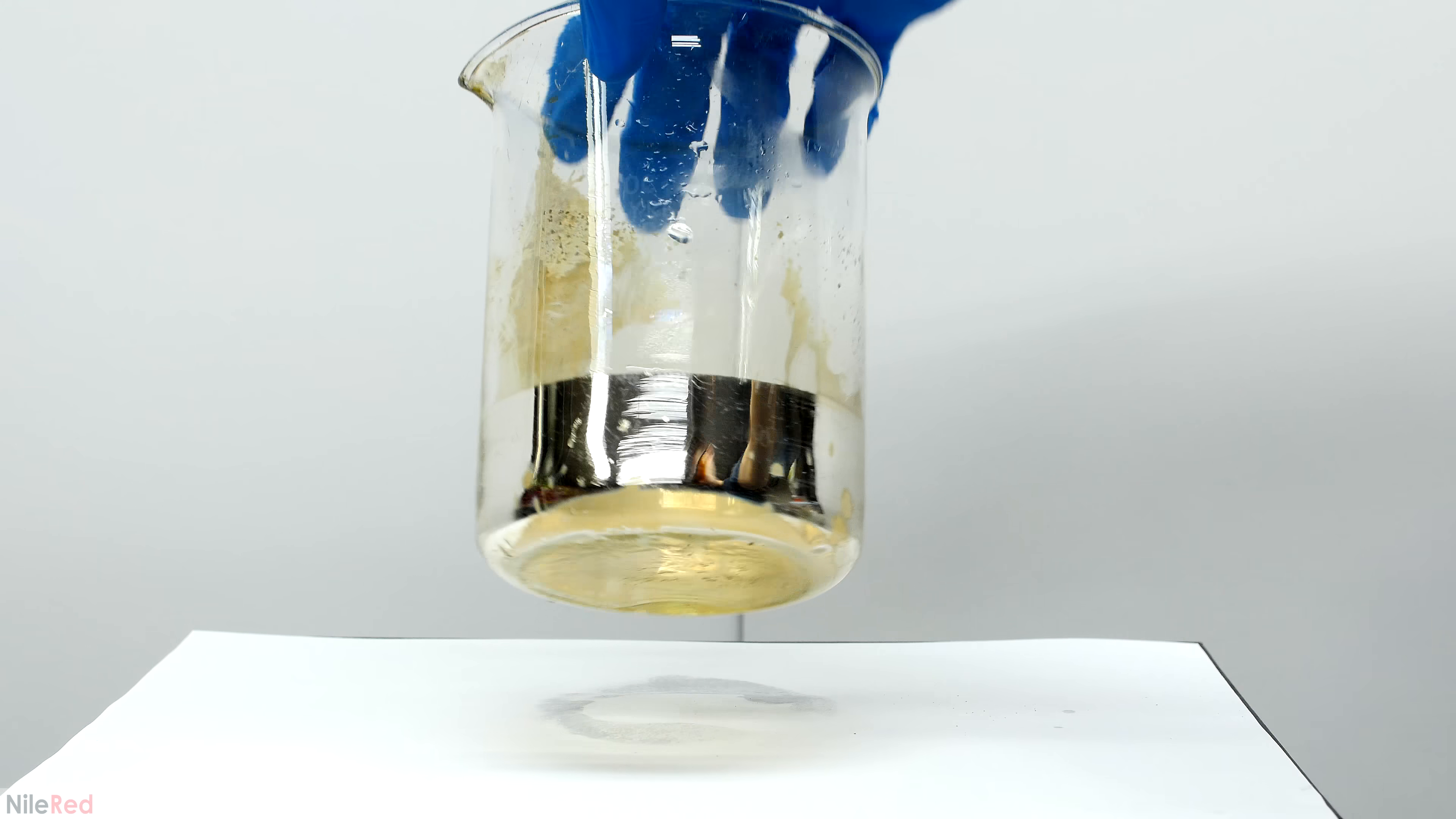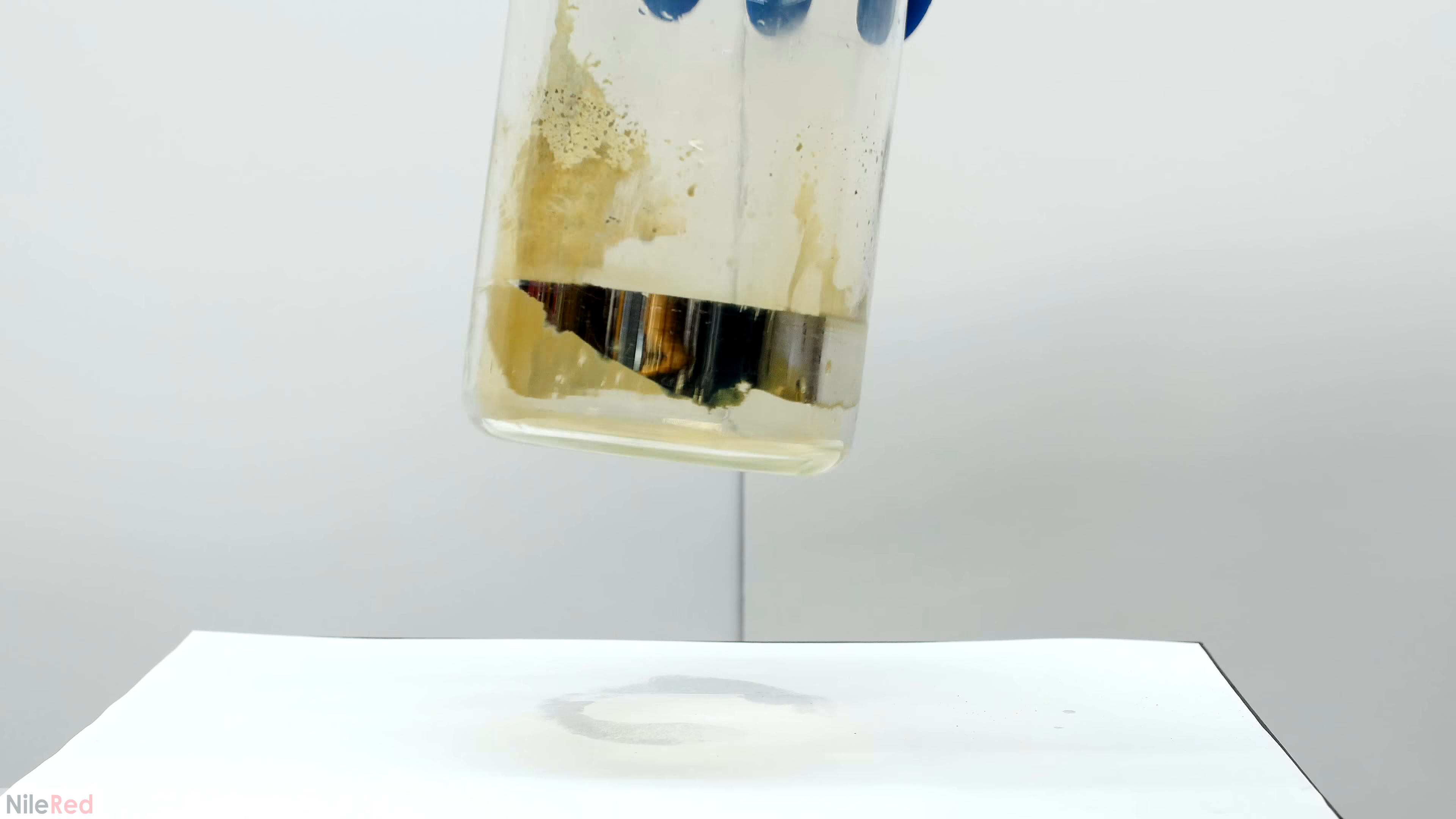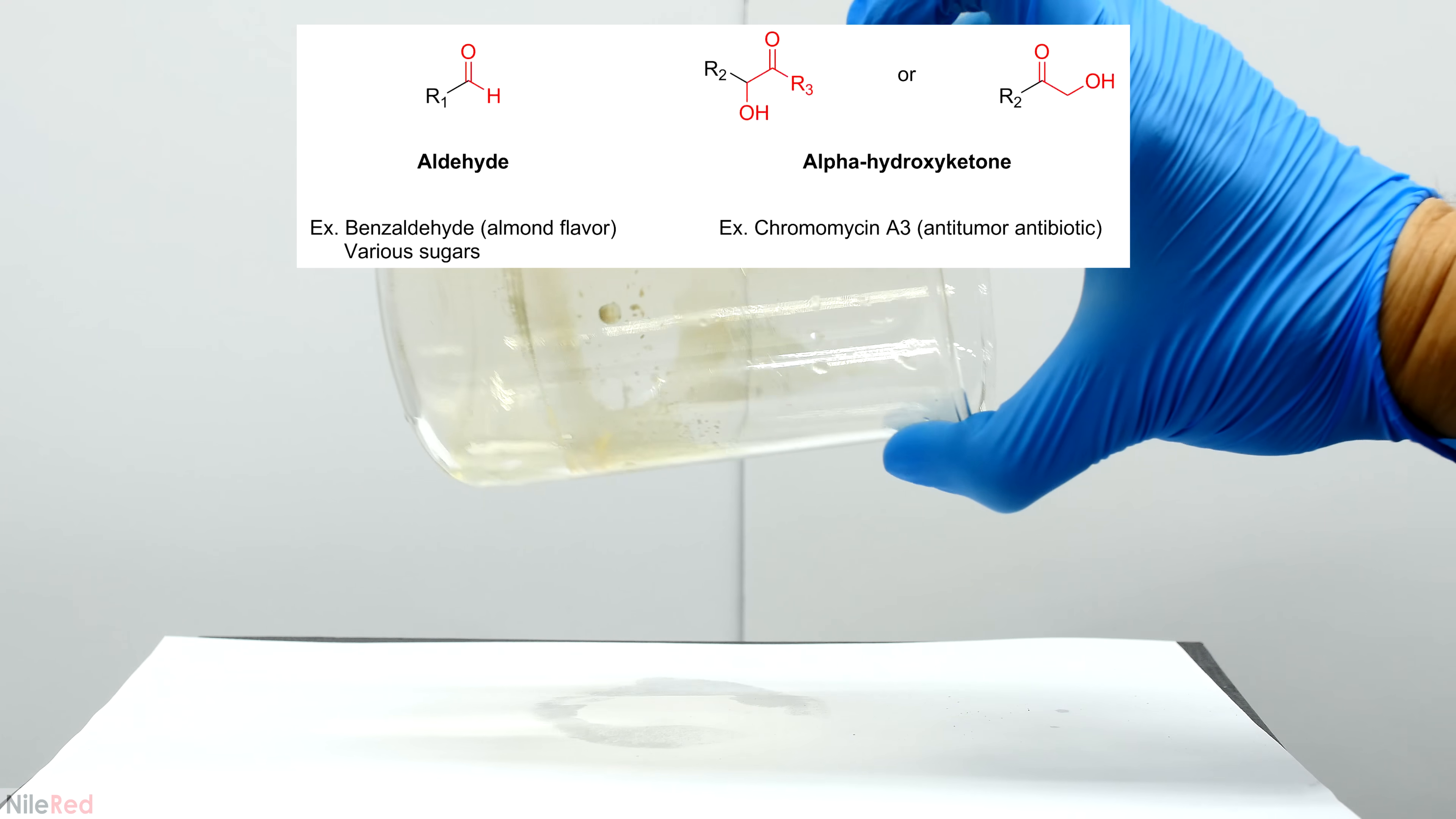That's about it for the silver mirror demo, and now I want to do some real Tollens tests. The most common use of the Tollens test is to determine whether an unknown contains either an aldehyde or an alpha hydroxy ketone. If the unknown does contain either of these groups, we'll get the same reaction that we just saw, and a mirror will form.